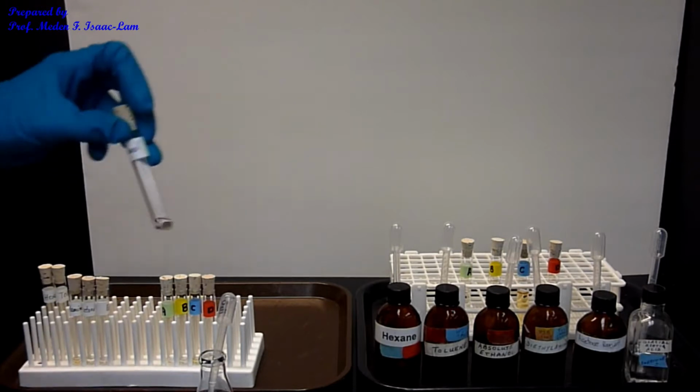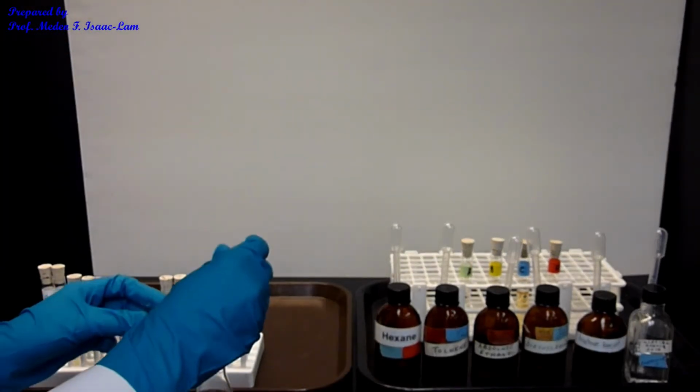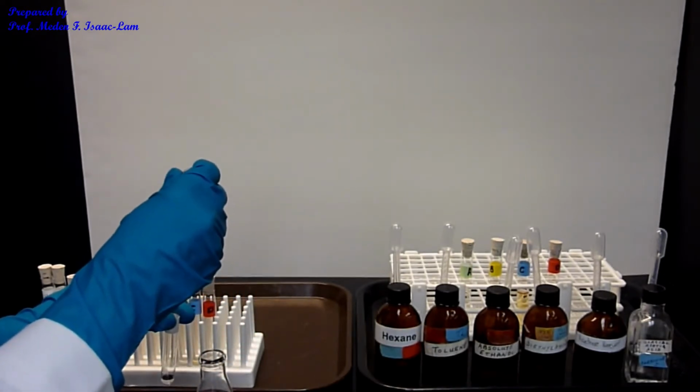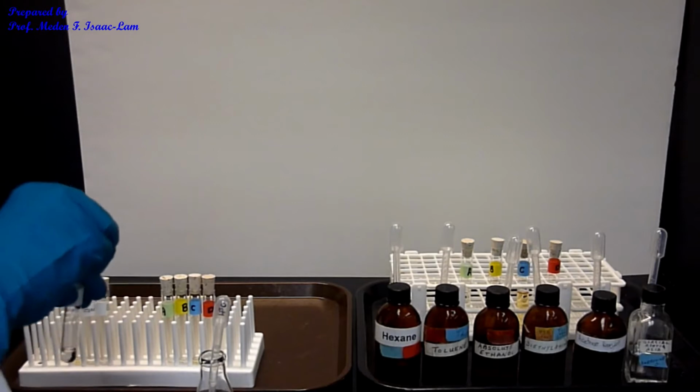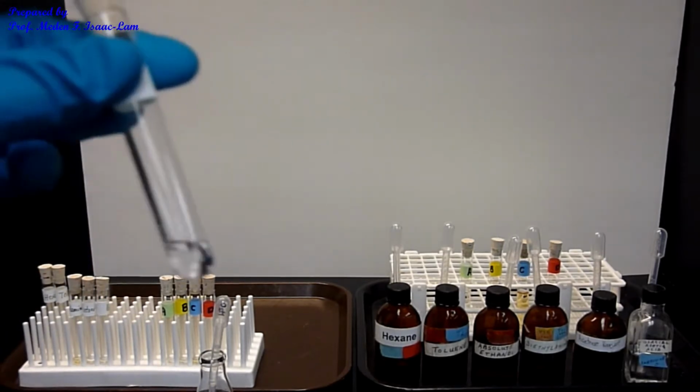Now I'm doing ethanol. So ethanol sample, 10 drops. I'm going to vortex it, mix a little bit, and now we're going to see. Okay, ethanol.